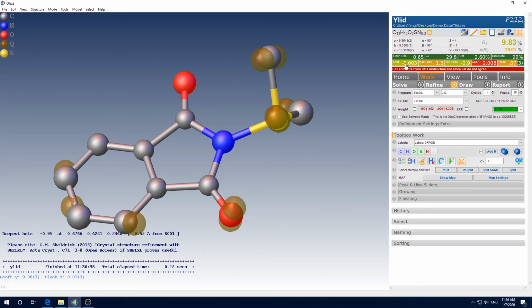until the shift stabilizes. Here is actually a good time to bring up an interesting note. These isotropic balls represent atoms, and their sizes should be similar. If one atom is significantly larger than others, that could mean one of two things.